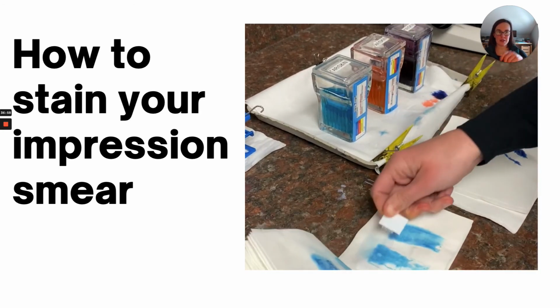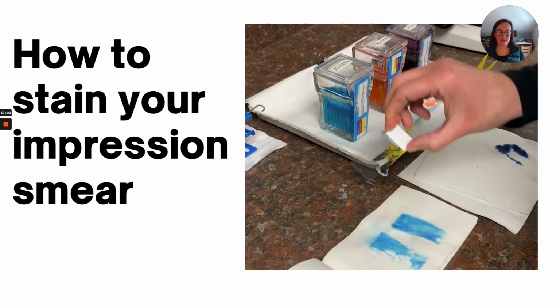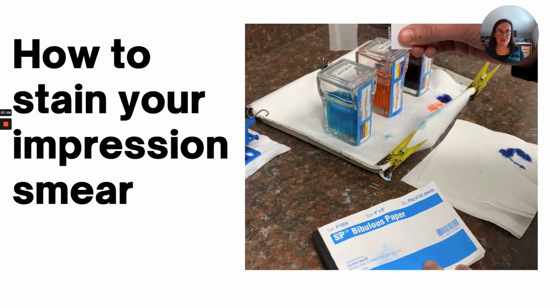If you're doing the eosin, then you do a rinse and then you go to methylene blue, that's fine. But it doesn't impact your diagnostic quality. So that's how you stain your slide. This actually was a slide from a normal dog. And so there's not a lot of uptake on there because there really wasn't a lot going on.